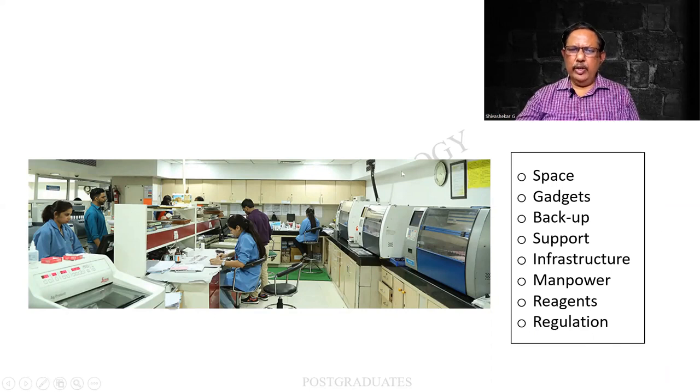There is space. All the gadgets are along the wall. You will be able to move around. The chairs and tables are all designed with leg spaces. And the machines, look at this one, it is so comfortably placed. It is not looking clumsy at all. Well lit, and there is provision for 24 hours of water supply and electricity. So the infrastructure, the manpower, the reagents, and the regulations for procuring and disposing of them, all these matter a lot.